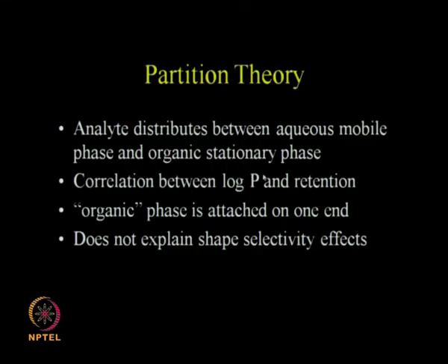So there is a correlation between this log P and the retention. If the log P is large, that means it is hydrophobic, then it stays put inside the column much longer. If the log P is small, that means the molecule is hydrophilic, so it comes out faster.